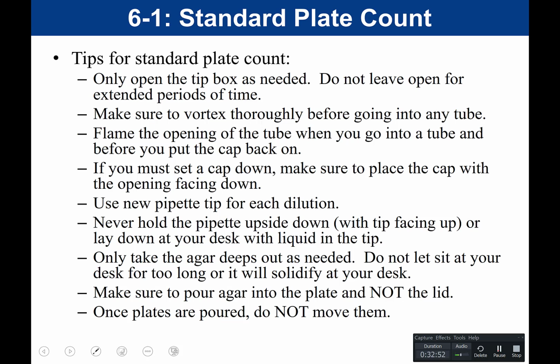Make sure to pour agar into the plate and not the lid. The lid is less shallow. It's not as deep. So you want to make sure that you don't pour the liquid into the lid, but instead that you pour it into the base of the plate.